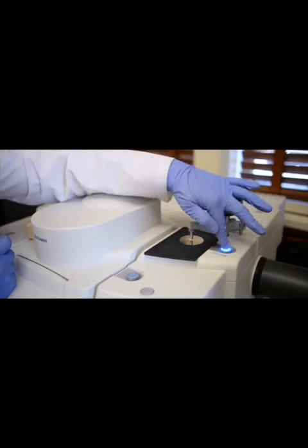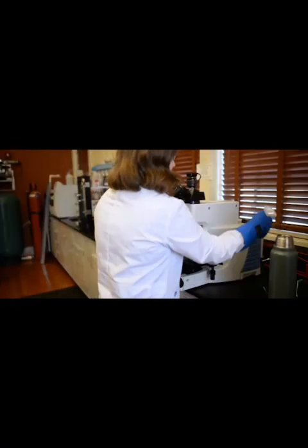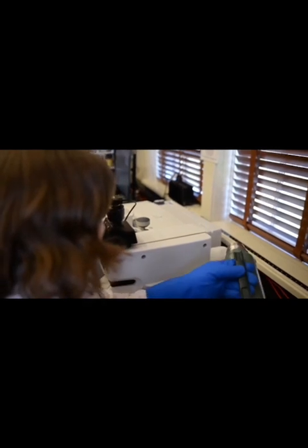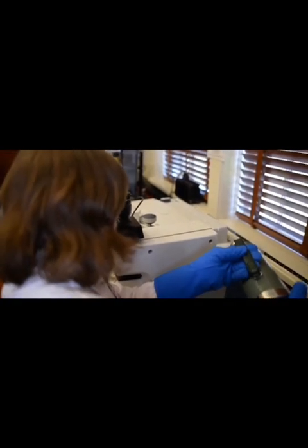To perform FTIR analysis, the sample is usually placed between KBr plates, as a thin film, or under attenuated total reflectance. Before analysis, a background spectrum is obtained to subtract from the final spectrum. The analysis is performed in attenuated total reflectance mode using the spectrometer, which collects the data. FTIR analysis is useful in identifying materials based on their spectral properties, and libraries of known spectra are used to determine what material a sample represents.